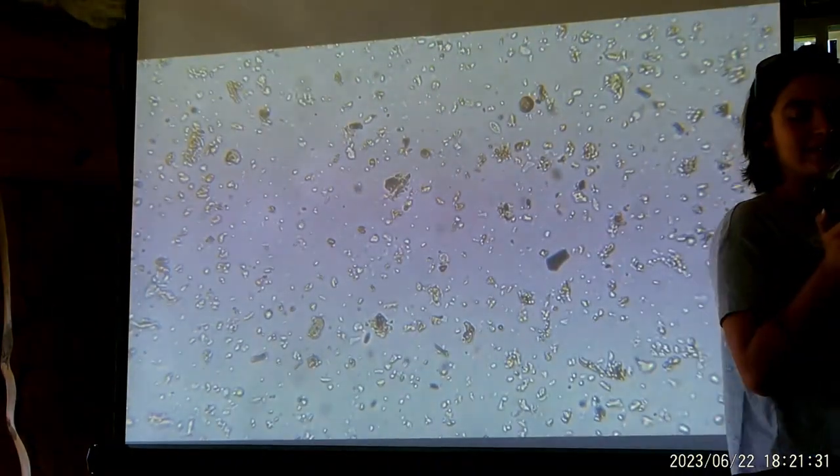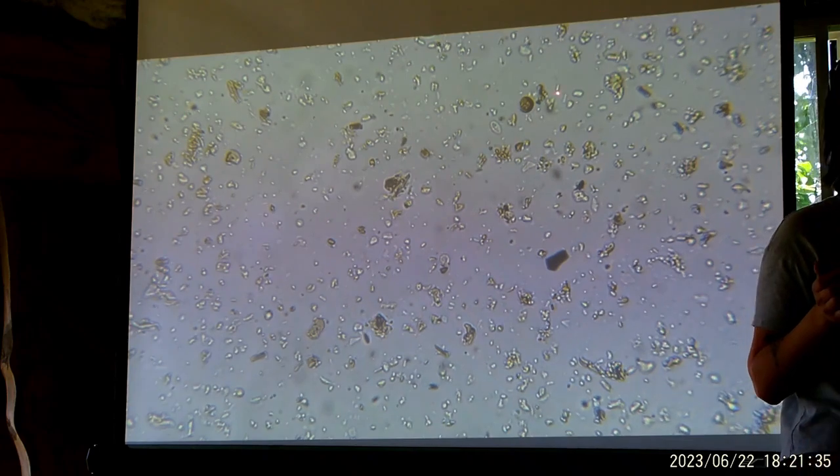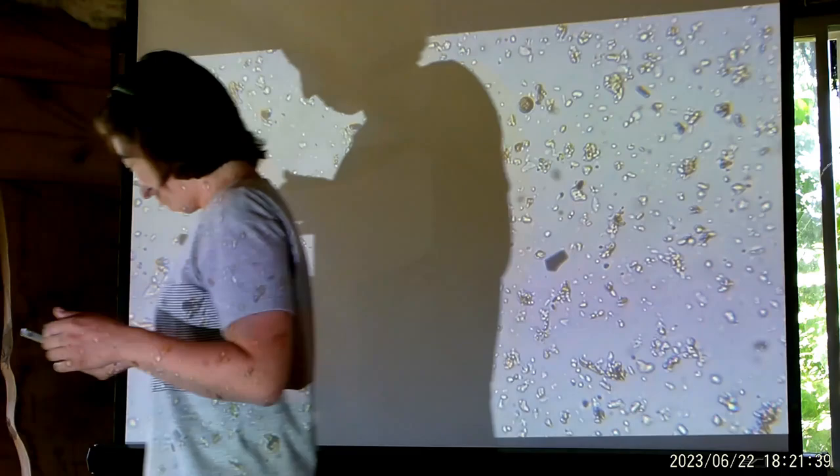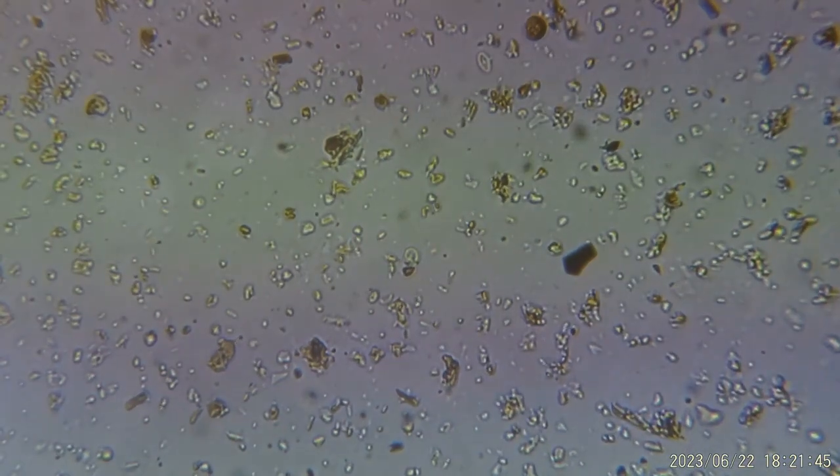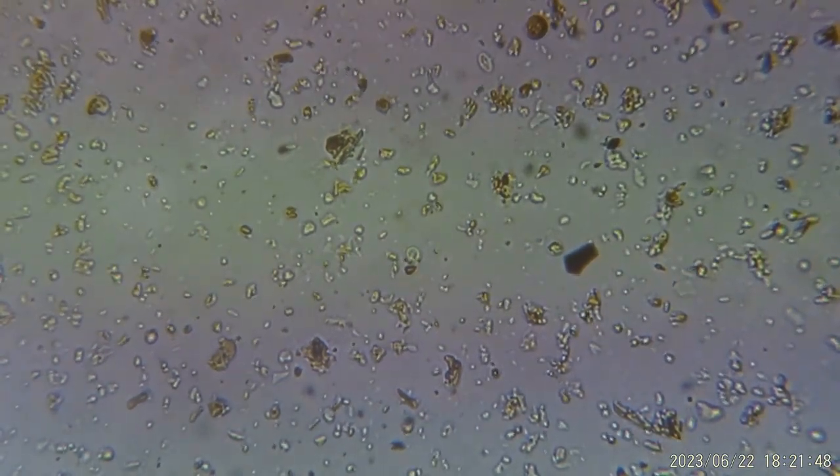And so, he's looking at it with the lens of creating this highly fungal type of compost, which I highly recommend everybody gets into, Johnson-Su bioreactors. The reason I bring that up is because there are two fungal spores here. There's this guy here and that there. We don't count them. I think the microbiometer also captures the presence of them. Correct. Part of the microbial.